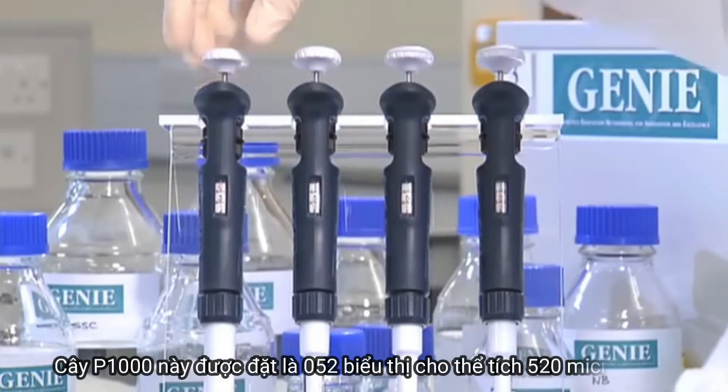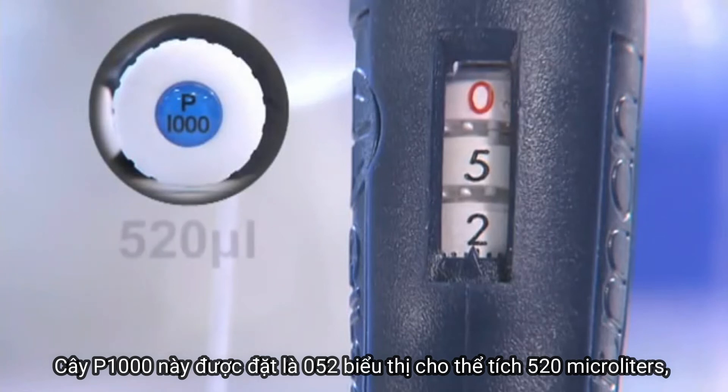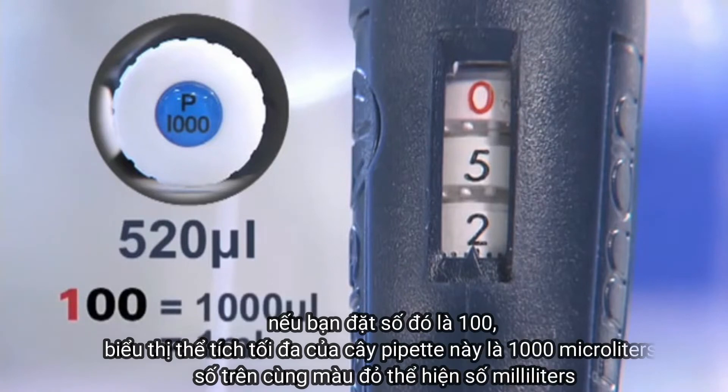This P1000 is set to zero, five, two, which indicates a volume of 520 microlitres. A setting of 100 indicates the maximum volume for this pipette, which is 1,000 microlitres. The uppermost number is in red, which for this pipette indicates the number of millilitres.